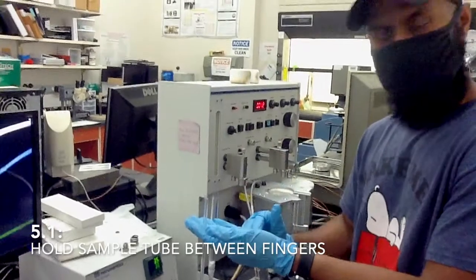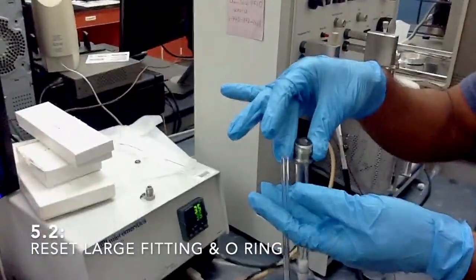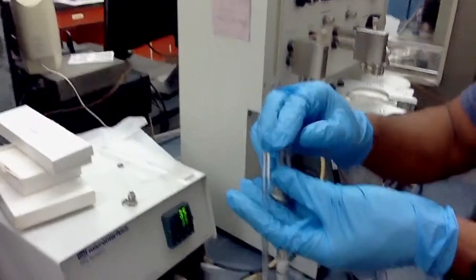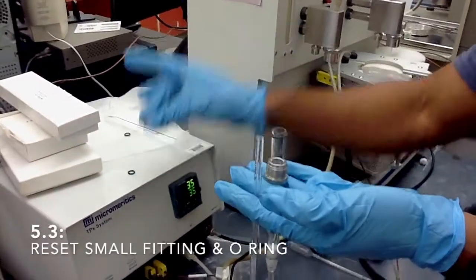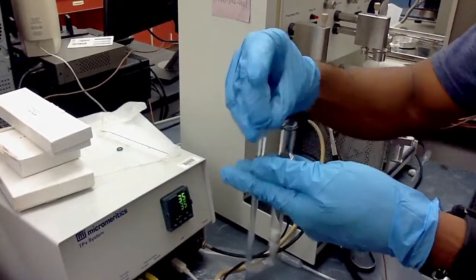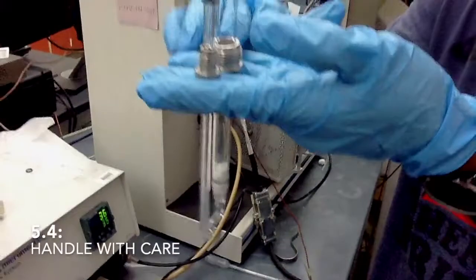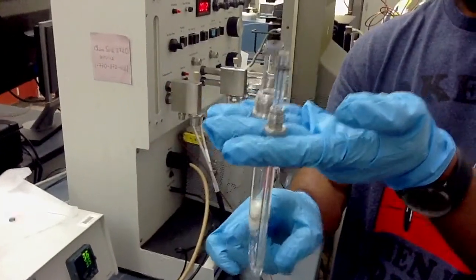Once our sample is prepared, we'll put back all those fittings which we took out before, and the O-ring on top of it, and the second one on this side, and also this O-ring here. Still be careful that you don't drop this metal piece here. This is really heavy, it will break this tube.